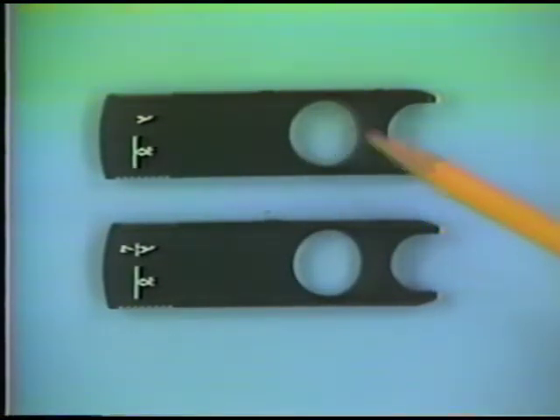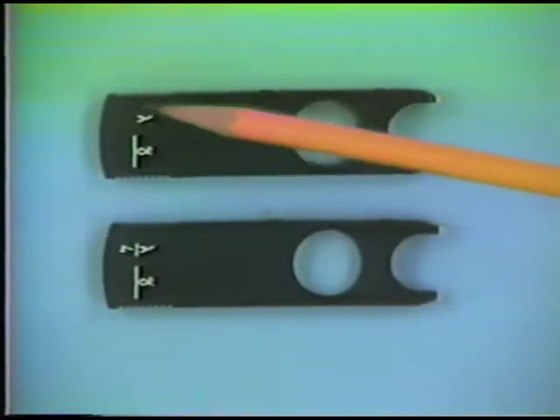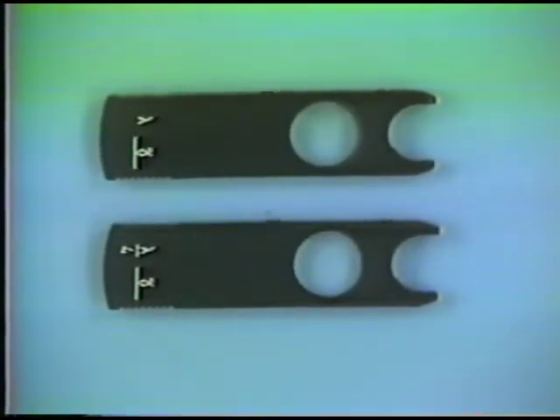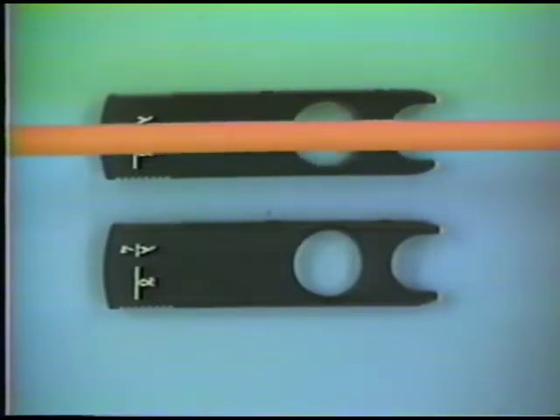that is actually in the accessory plate is made out of gypsum, and you can see this transparent portion of gypsum here. Another important thing about these accessory plates is they typically have a line on them, and you can see this line going across. That line is very important to notice, because some accessory plates have this line oriented across the plate, and others have them oriented along the plate.